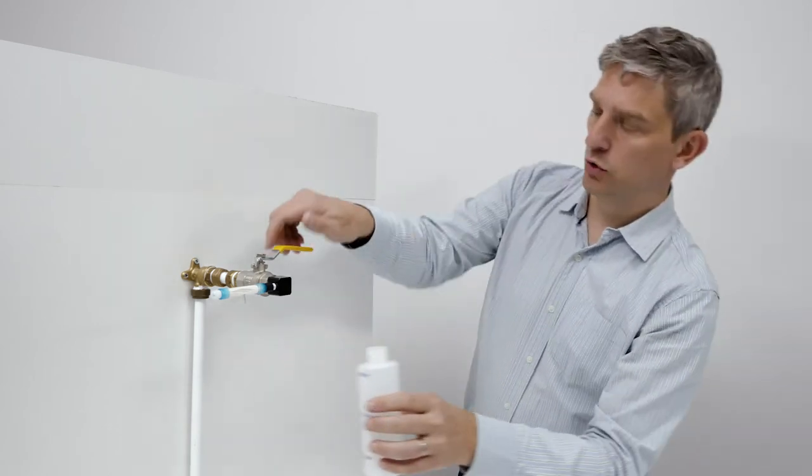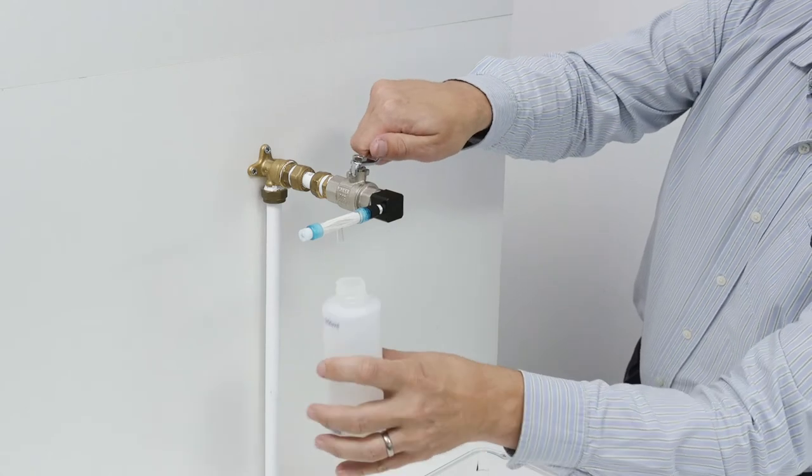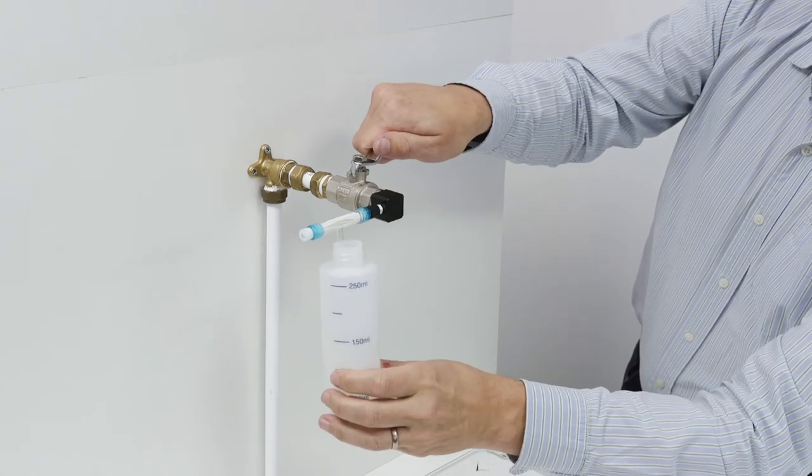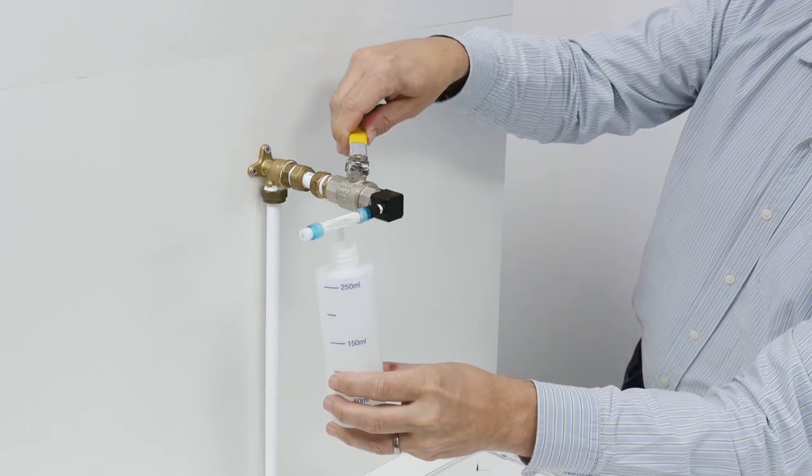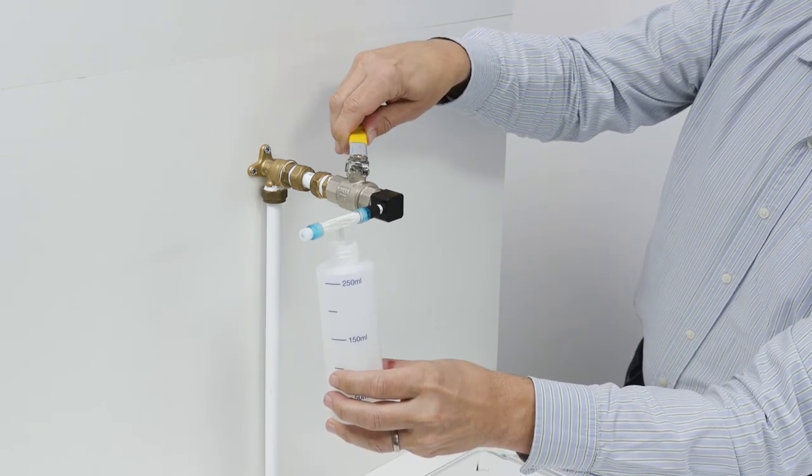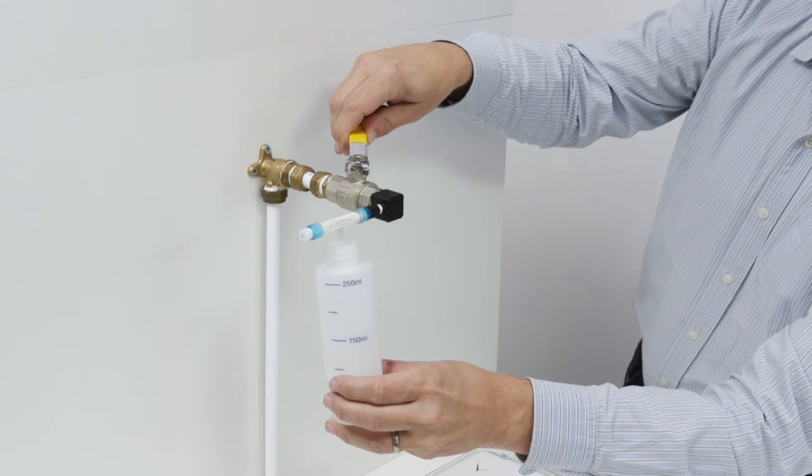We take the cap off, and then we can open the valve and start measuring the water that's passed through the filter. We keep going until we get to 250 milliliters.